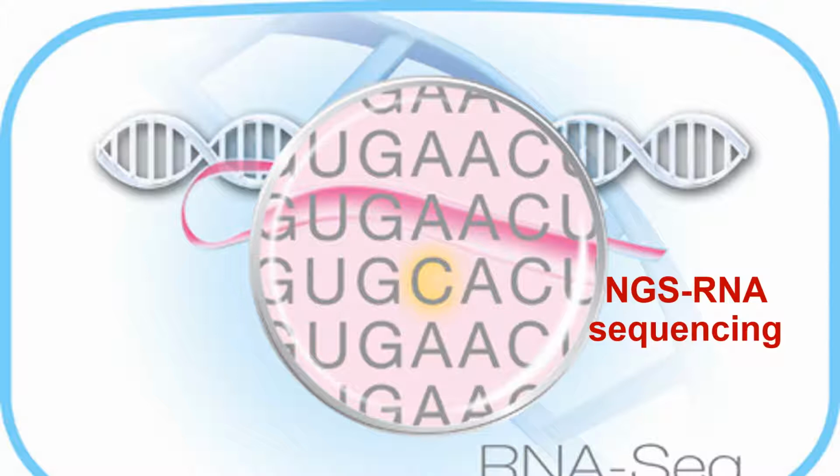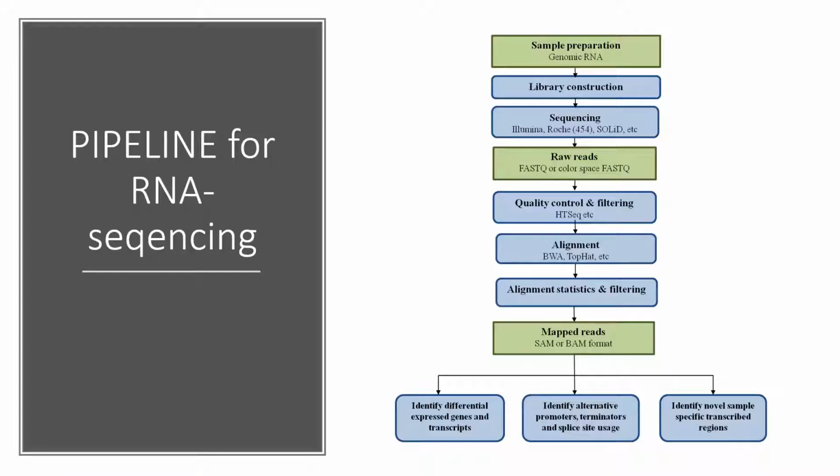Next, we will move on to the next generation sequence, the RNA sequence obtained after next generation sequencing and its analysis using bioinformatics tools. This is an overview slide which explains the pipeline for RNA sequencing.